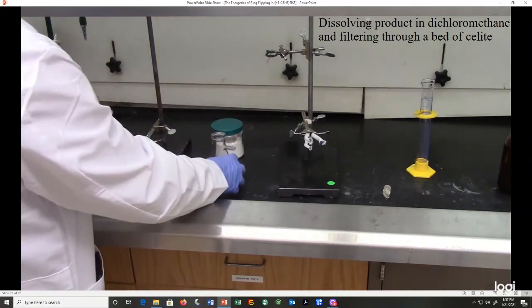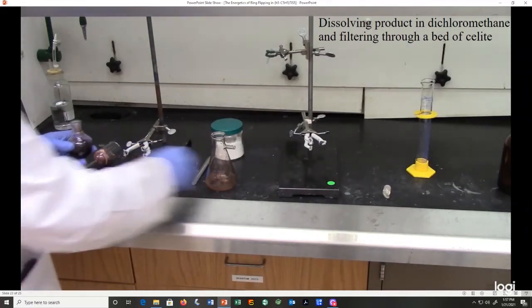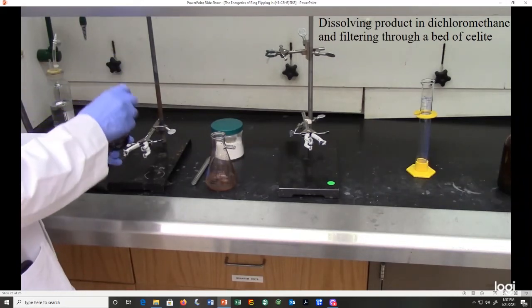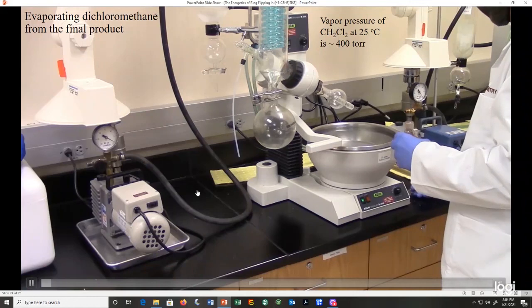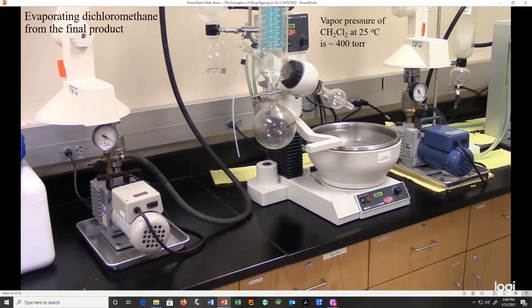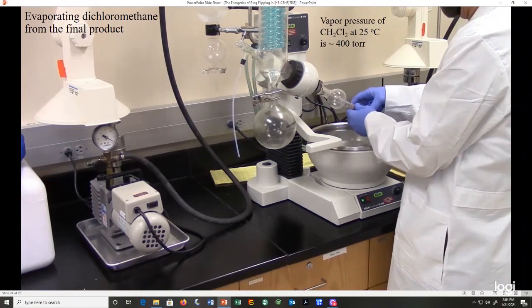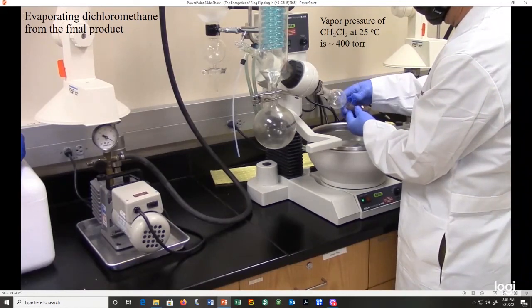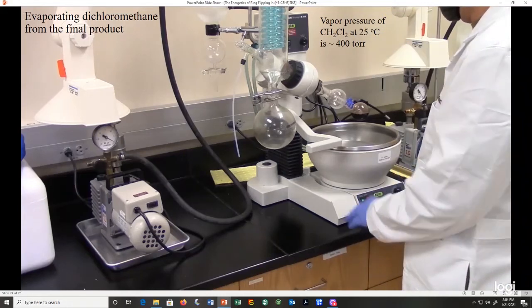And now we're ready to rotovap off our dichloromethane. So at this point, we just need to evaporate the dichloromethane from our product. In this case, the vapor pressure of dichloromethane at 25 degrees is about 400 torr, so the water bath in this case has been set to 25 degrees.